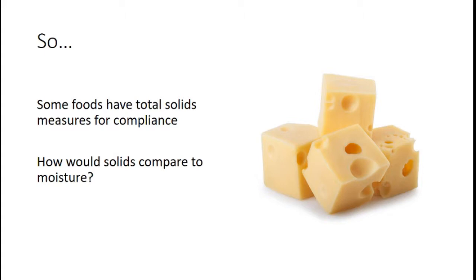We also want to mention that solids content is sometimes the measure of note, and the methodology for measuring moisture versus solids, total solids in this case, is extremely similar. We are just using a slightly different mathematical approach. There are some other ways that solids are measured, for example Brix content, but we are measuring total solids, and this could be soluble or insoluble solids, and Brix is measuring soluble solids specifically.